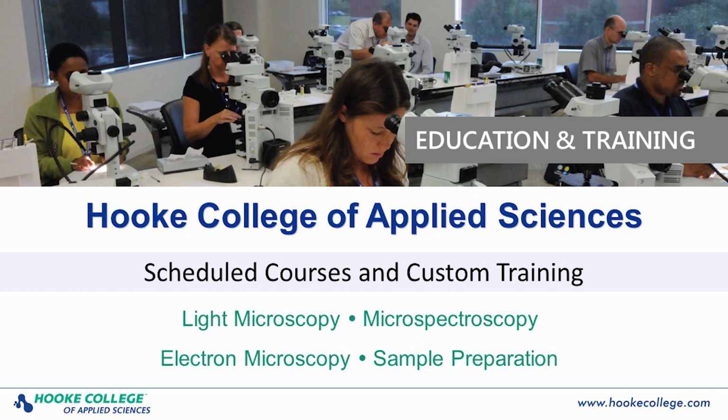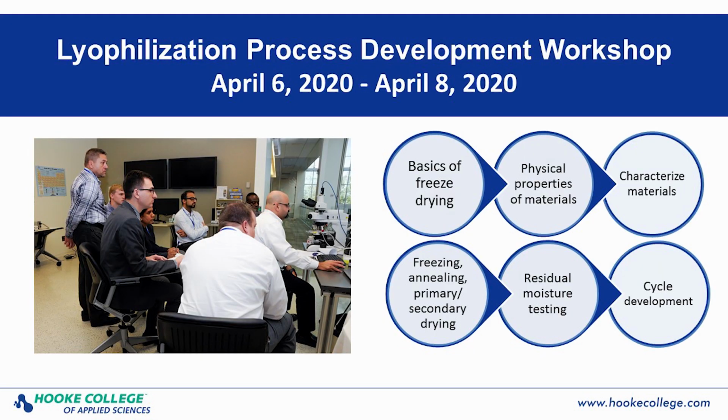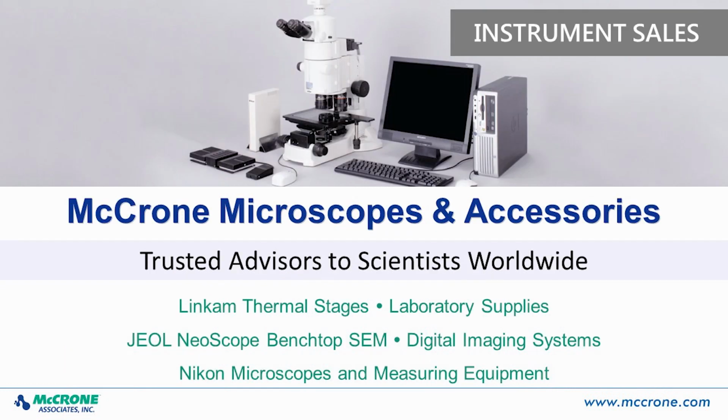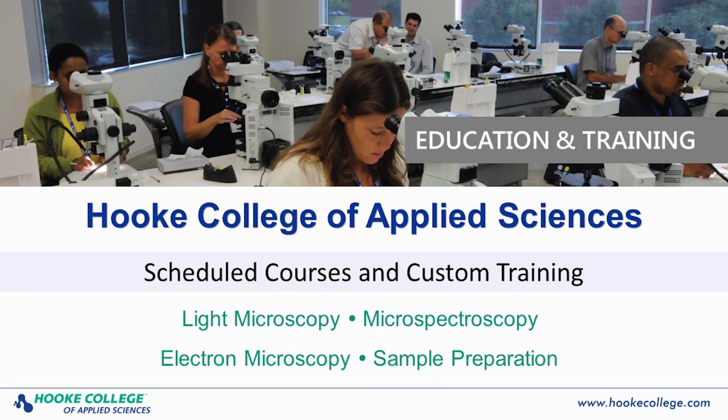Okay, here's a second question from Jody. Jody's asking, it looks like a lot of freezing and primary drying optimization is based on AccuFlux and auto-dry. How could we transfer an optimized cycle using those features if they are not present on our production freeze dryer? That's a good question. Maybe something I may have glanced over in the presentation originally.